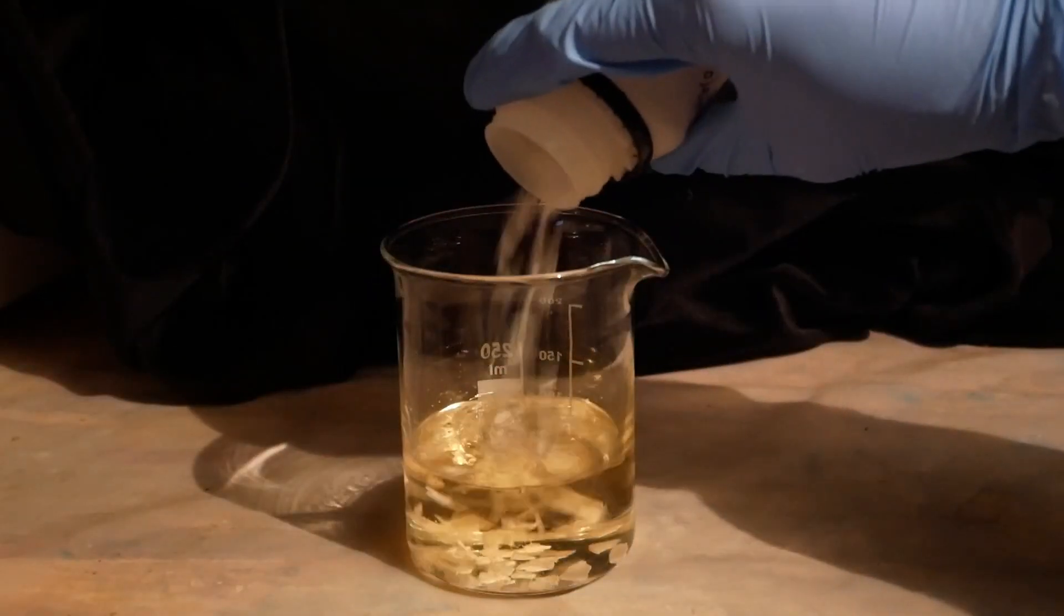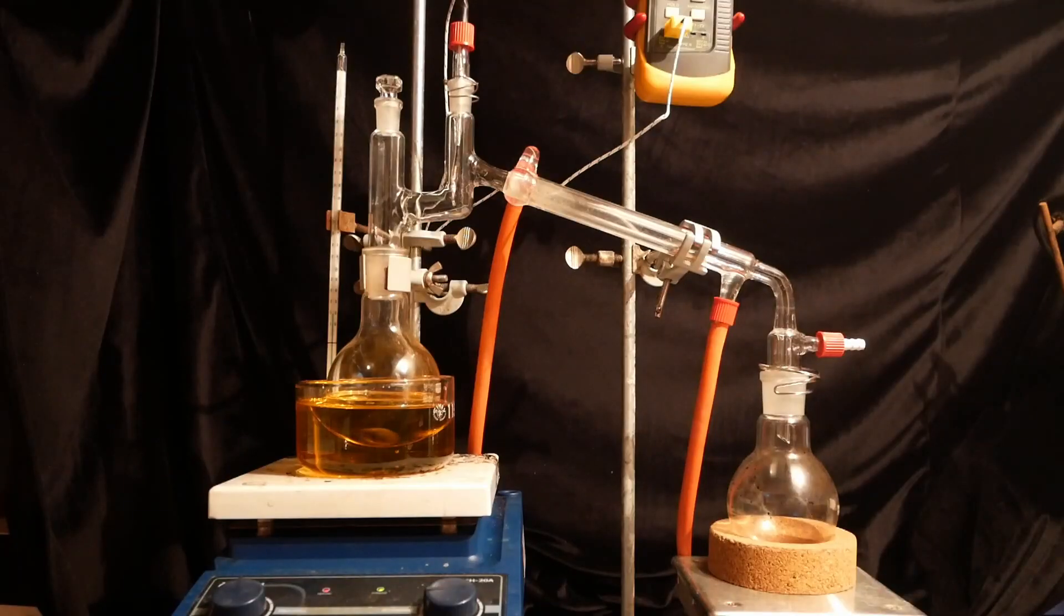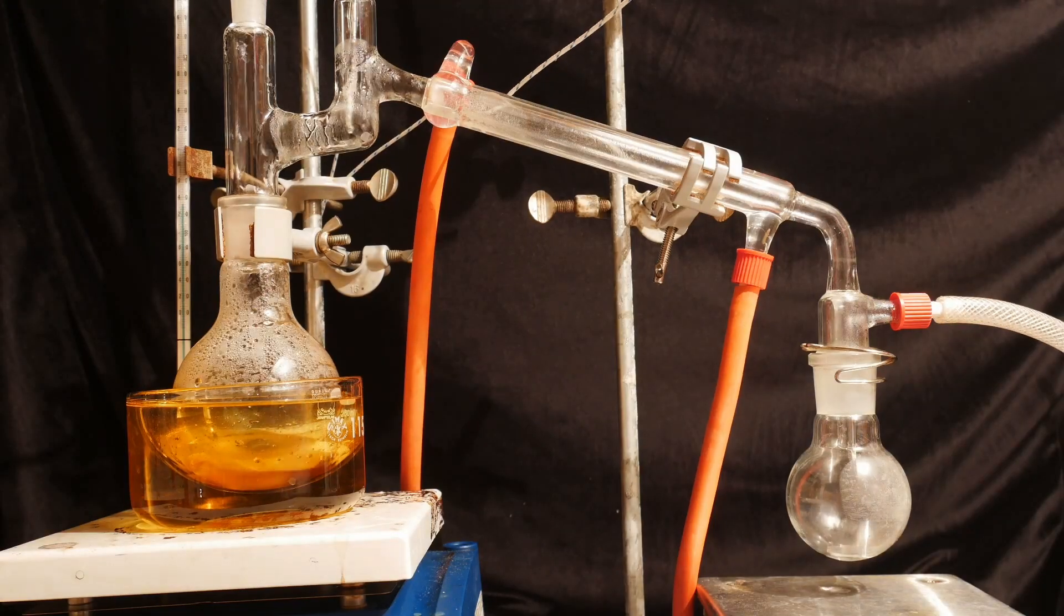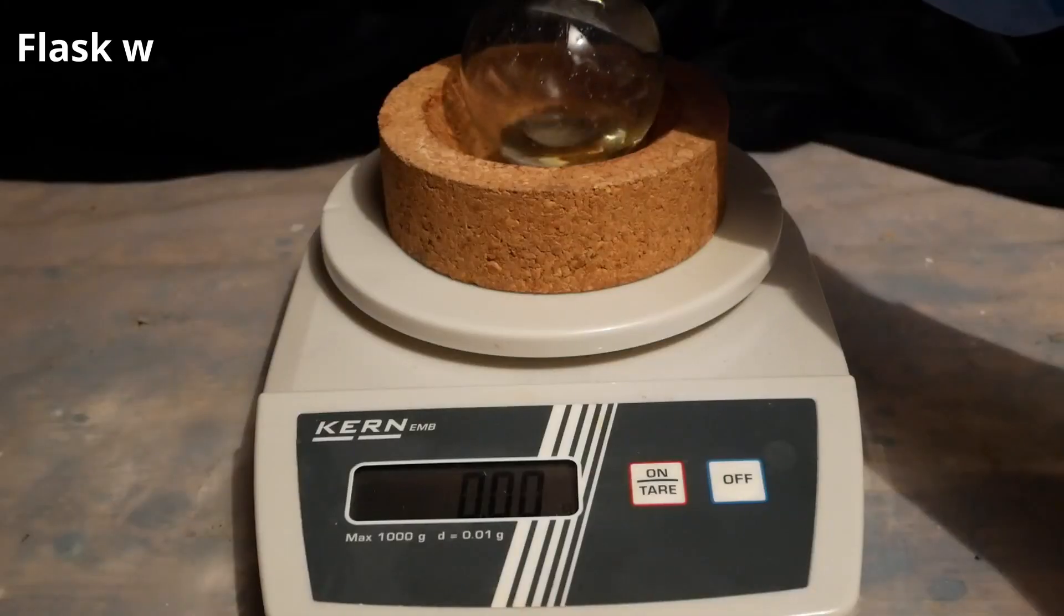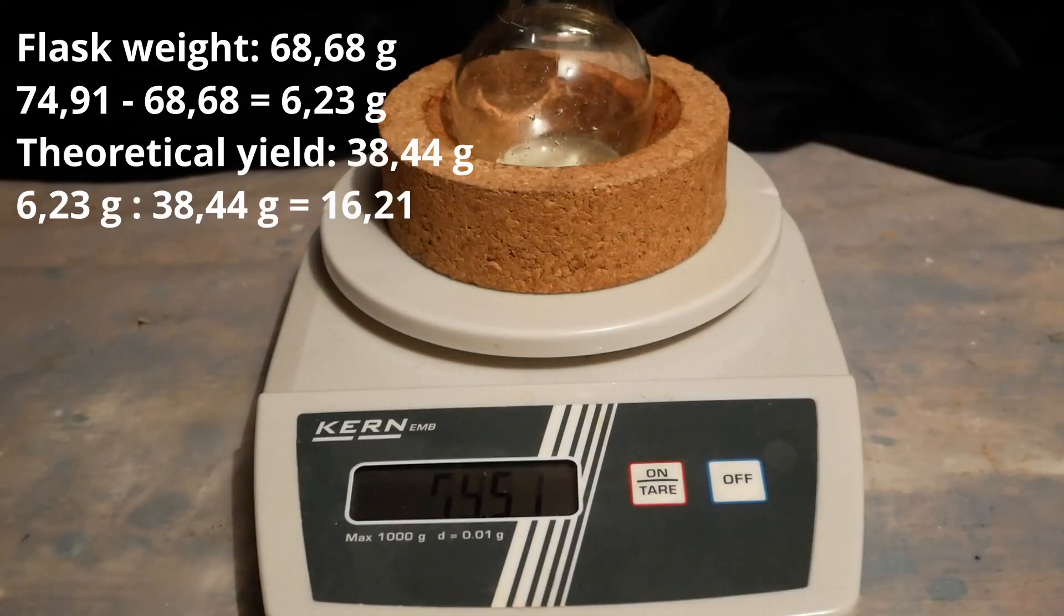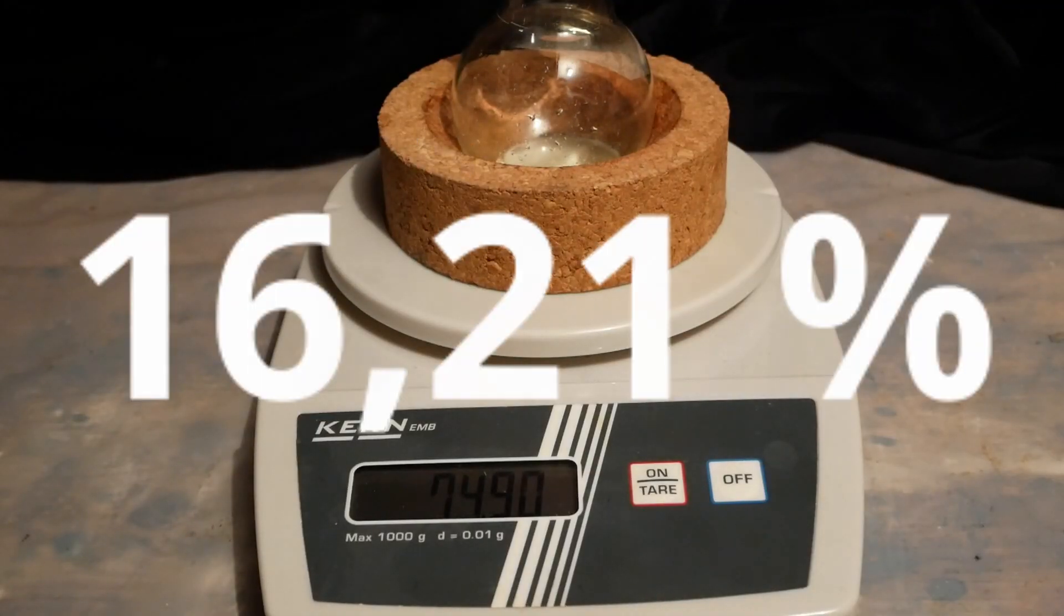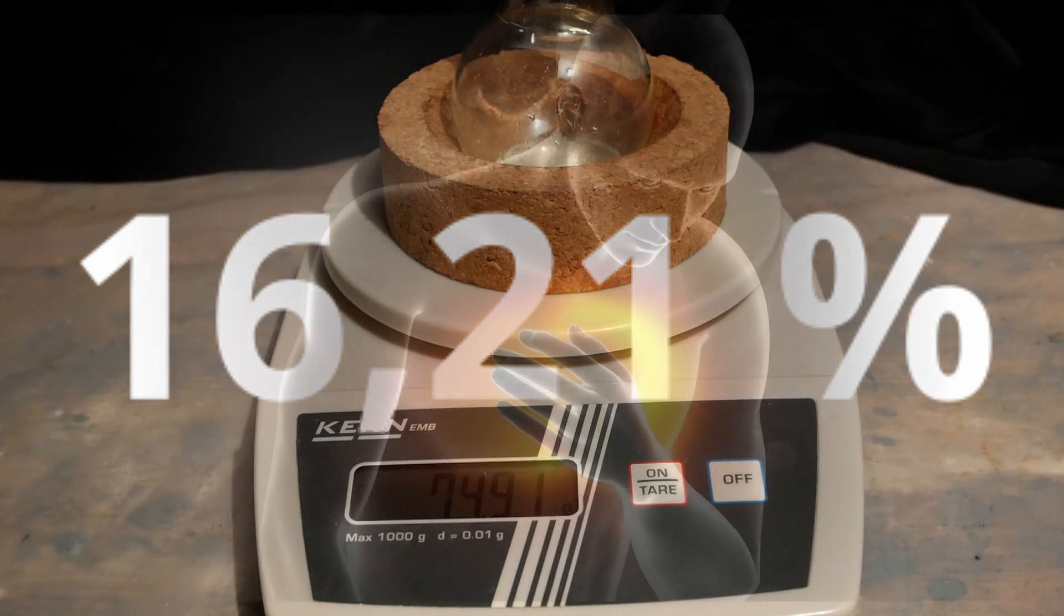Added salt to precipitate the aniline and extracted three times with DCM. Dried the extracts over potassium hydroxide, distilled off the DCM and then vacuum distilled the aniline. The product is much less yellow this time so I produced a purer product in this run. But the yield is still garbage. In fact, it's even worse than the last run.